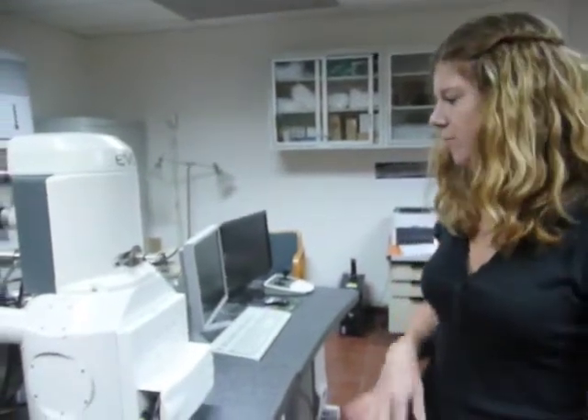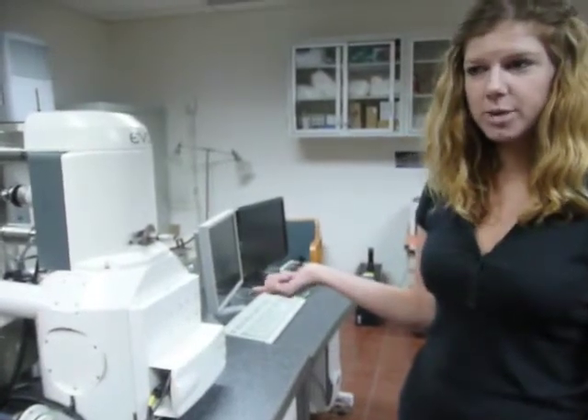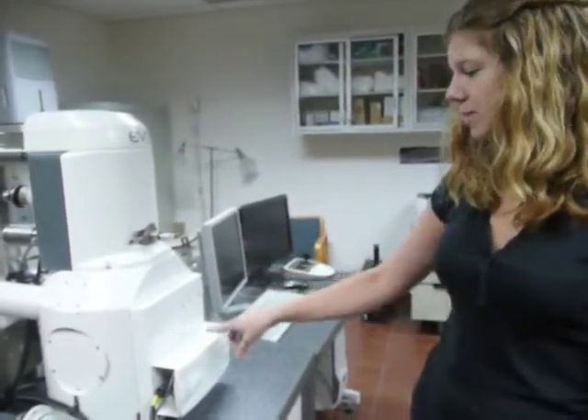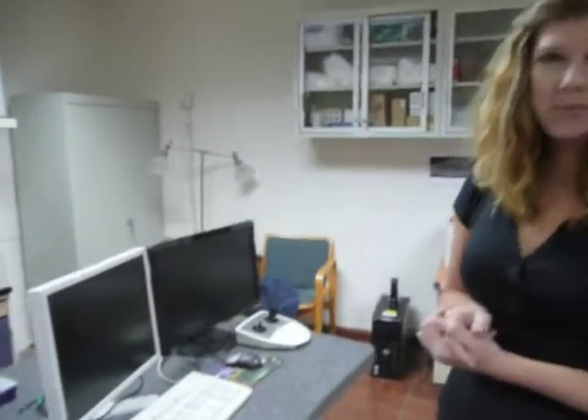This is the gold coater that we use after CO2 critical point drying and mounting the stubs — it adds another conductive element to give the specimens a little bit higher resolution. After we coat the specimens, we put them in the SEM. This is the chamber — it's a high vacuum chamber. The specimens go in here, and then we're able to use the computer and SEM software to view the images.